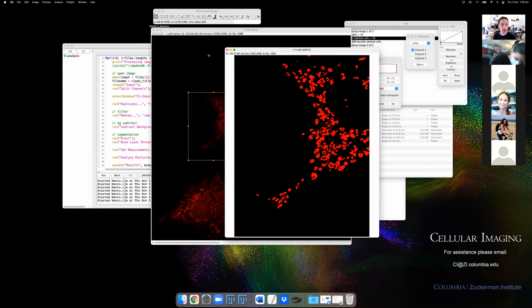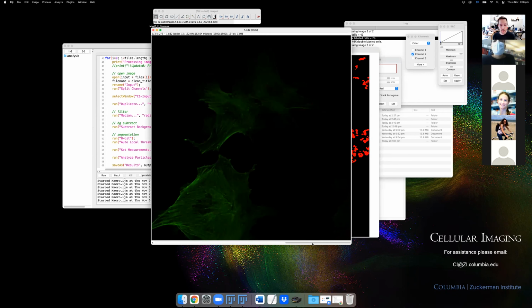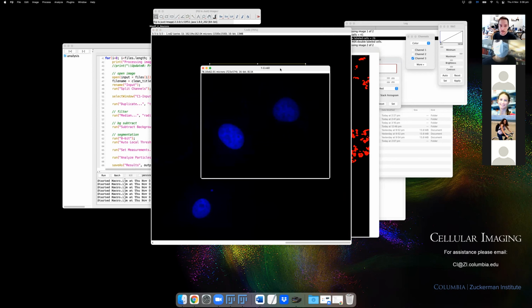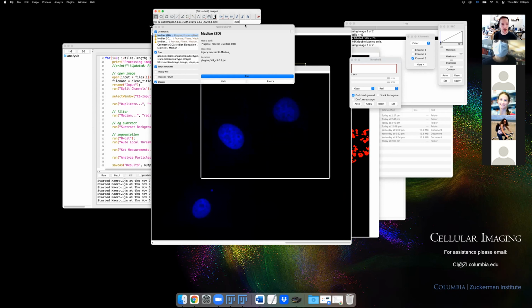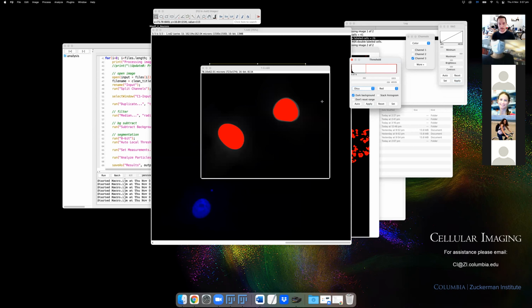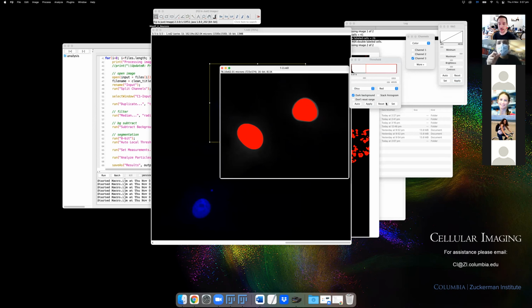We've already dealt with how to handle the nuclei marker. We can just have a quick look at these guys. Just going to duplicate them. In something like this, we could do another median filter. This is pretty clear cut. There's not much background, but we could put a filter in just to clean them up a little bit. And then, again, Otsu is probably fine for this because there's just a strong foreground on a very dark background. It's not going to have any trouble finding a boundary. So that's how we could find the boundary for those.